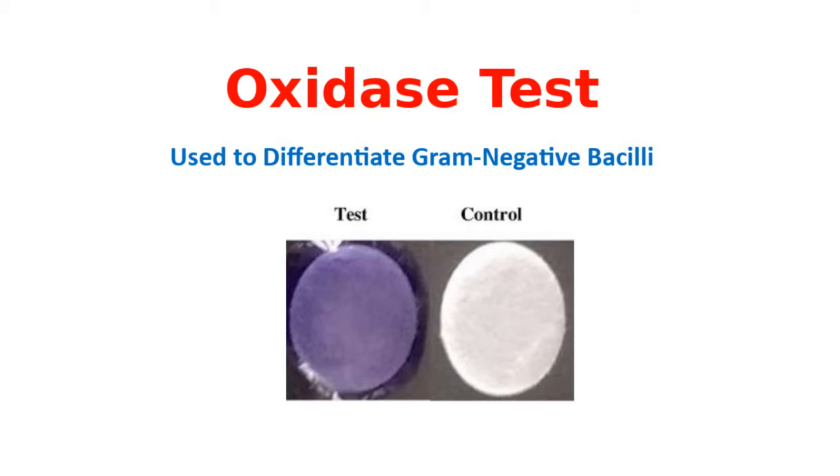The oxidase test is really important to differentiate gram-negative bacilli, right? And we're going to differentiate them as those things that are oxidase positive.